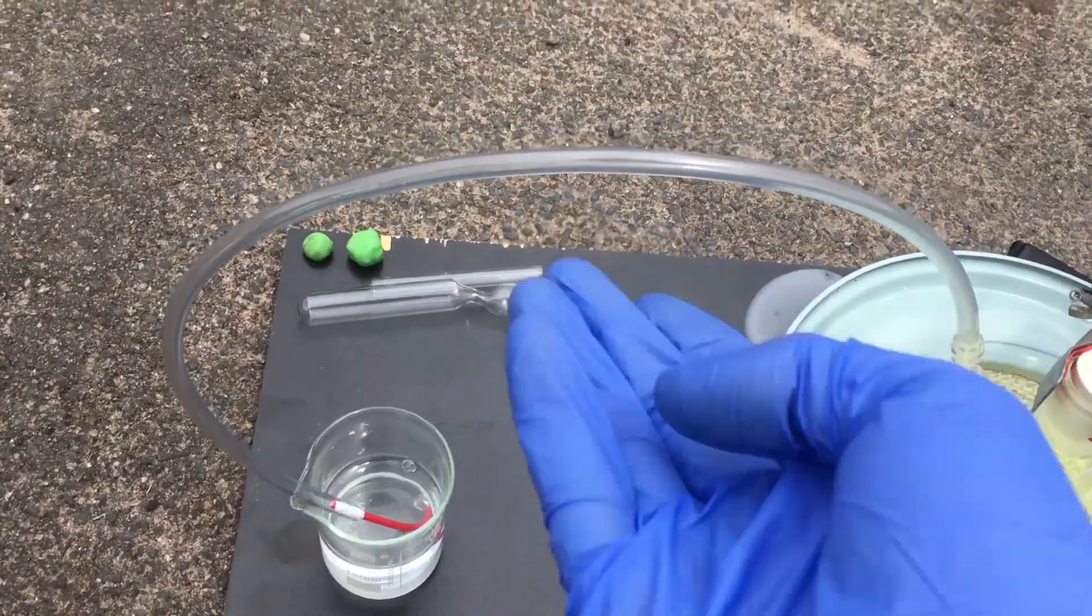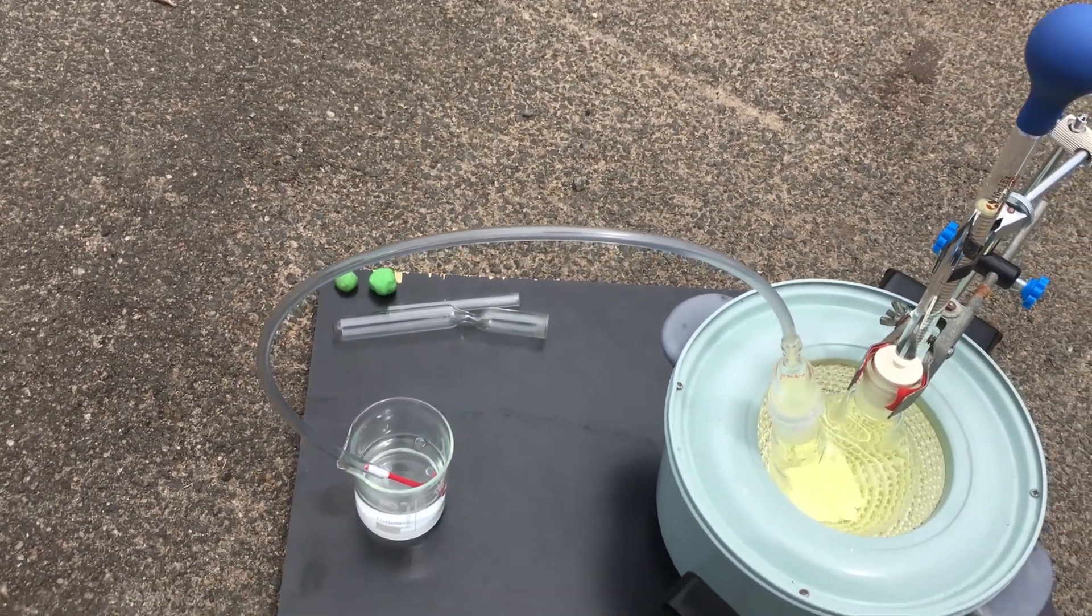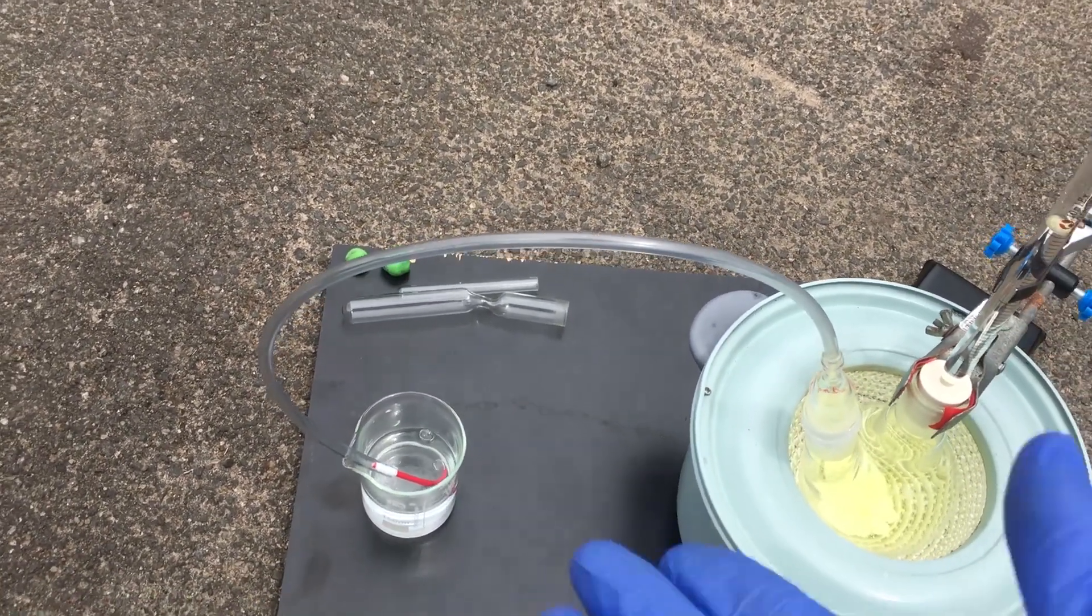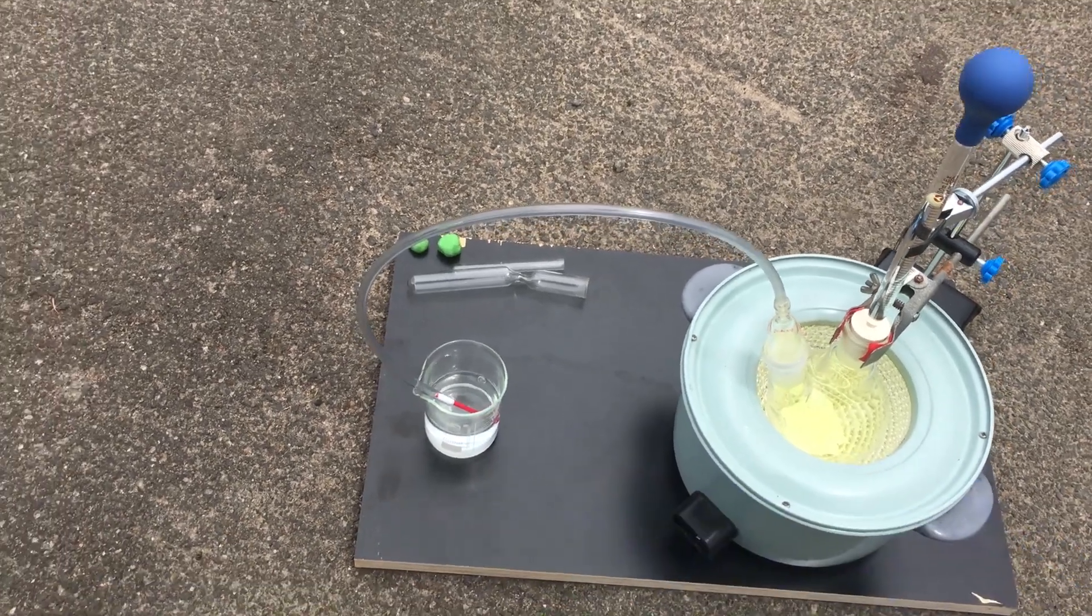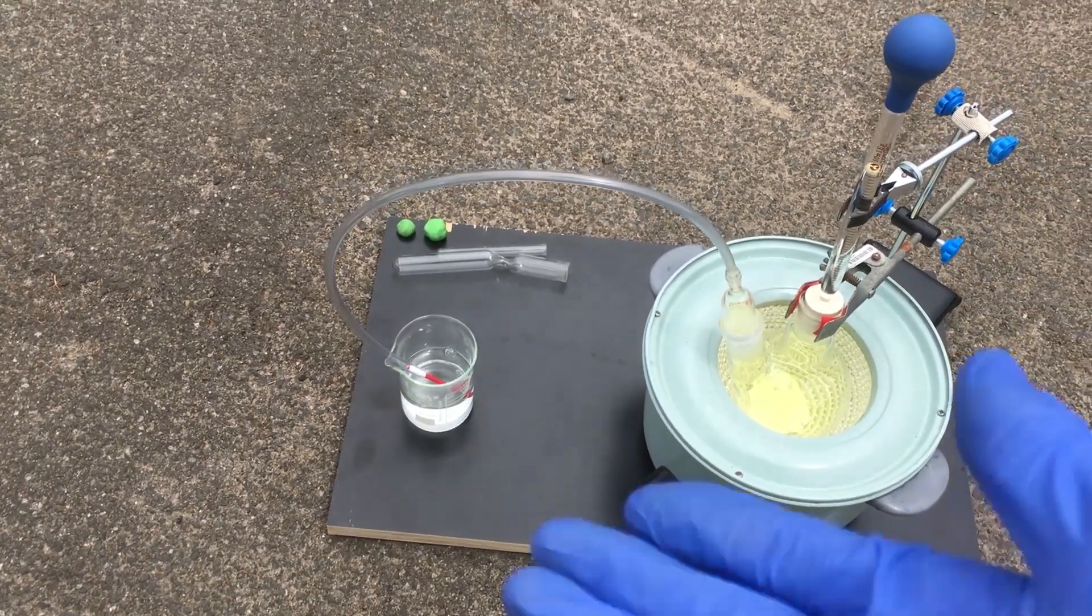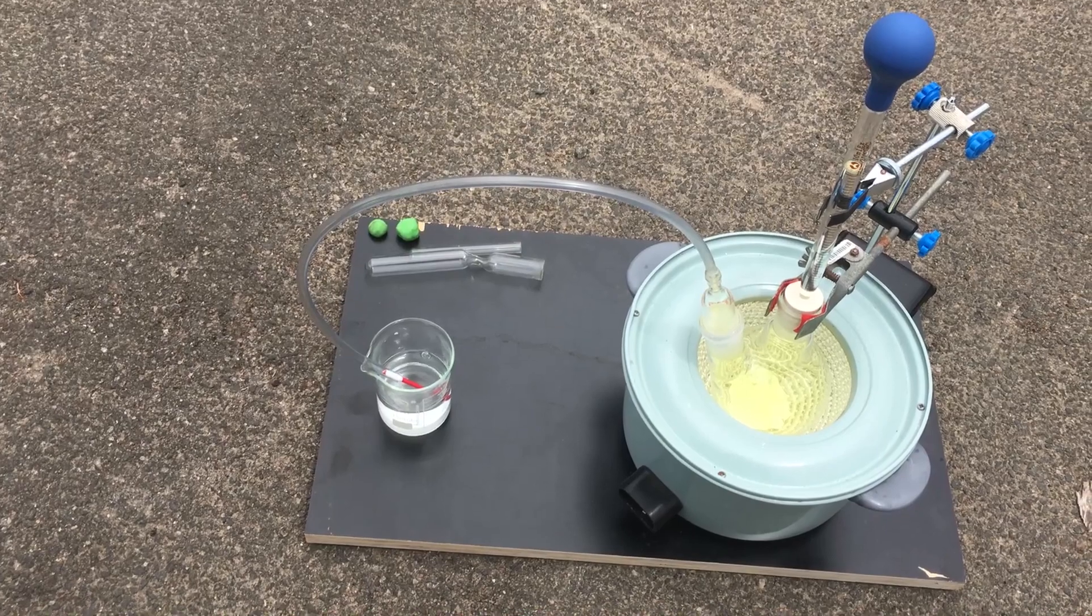Also, this vinyl tube is just pretty much sacrificial. It's in no way going to stand up to the chlorine running through. But really, it's so cheap. We'll just use it for this one time.